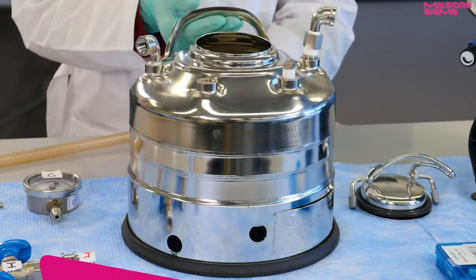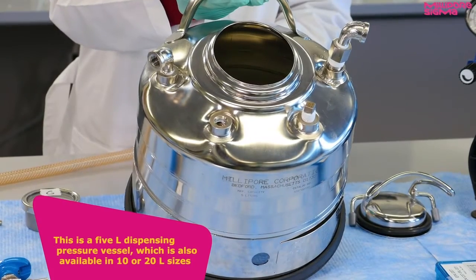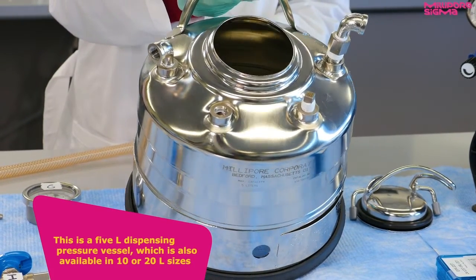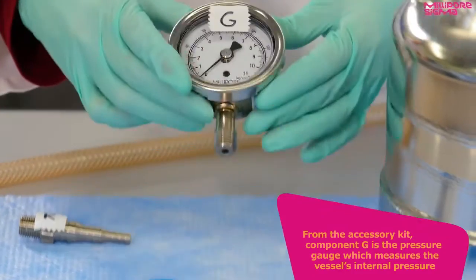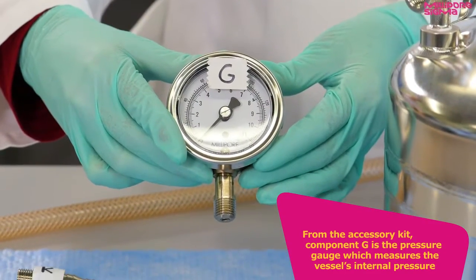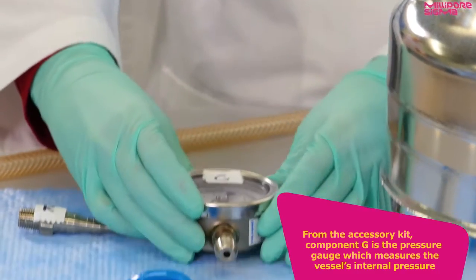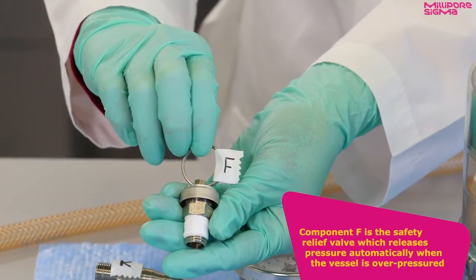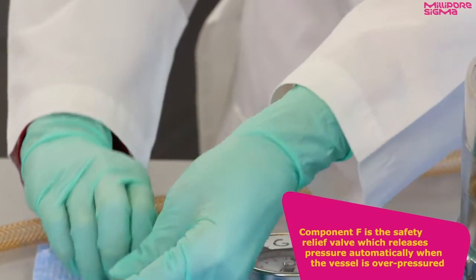This is a 5-liter dispensing pressure vessel, which is also available in 10 or 20-liter sizes. From the accessory kit, component G is the pressure gauge, which measures the vessel's internal pressure. Component F is the safety relief valve, which releases pressure automatically when the vessel is overpressured.